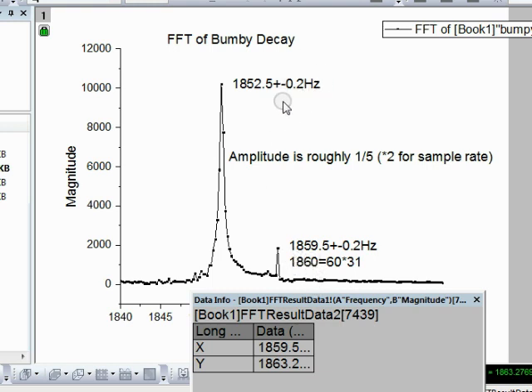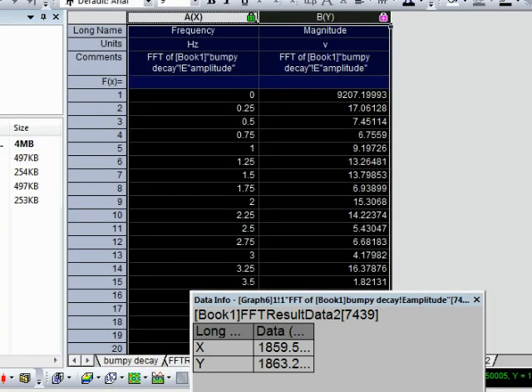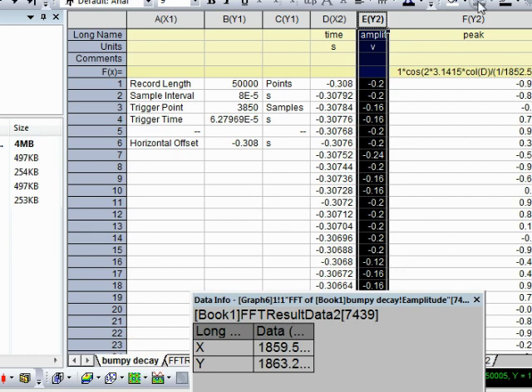I put my uncertainty as 0.2 hertz simply because if I click one point bigger or one point smaller, it's 0.2 hertz. Technically, you should be using standard deviation for that, but as a rough estimate I put 0.2 hertz. Now, using those frequencies that I've found and this difference in amplitude, I created two sine functions. Let's go back to my data and go to this worksheet.